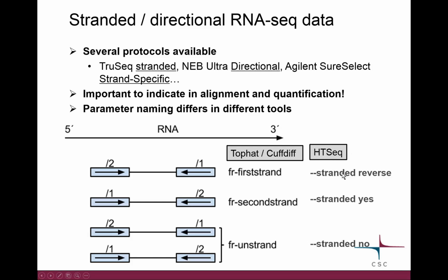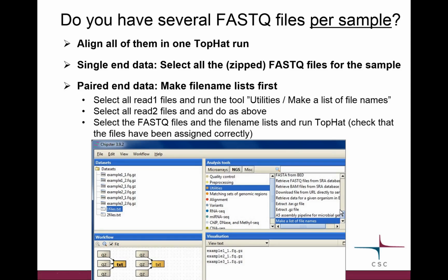And later on, when we do counting, we have exactly the same situation. So again, we have to know which way the data is stranded.